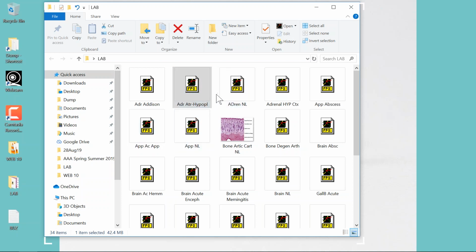Number one, you're at the second year medical school level and you probably already taken a histology course. And number two, you have been present or at least understand the concepts that we talked about in the previous 9 webinars. Okay, here's another thing that says ADR. So let's see what that says.